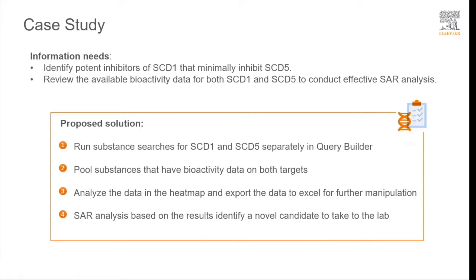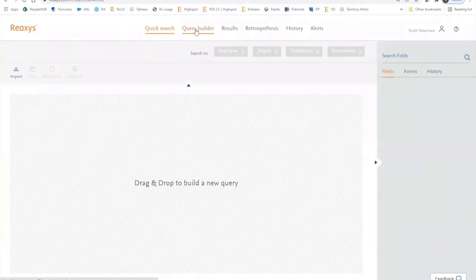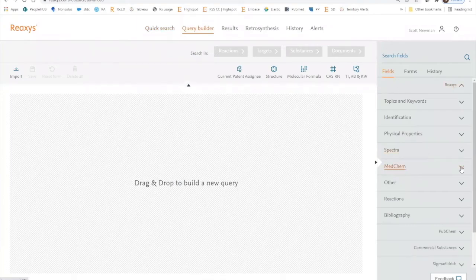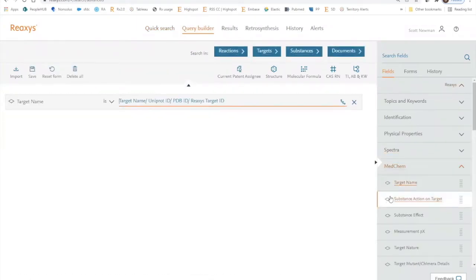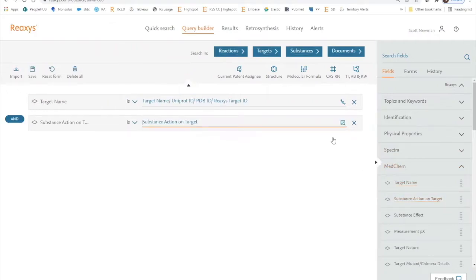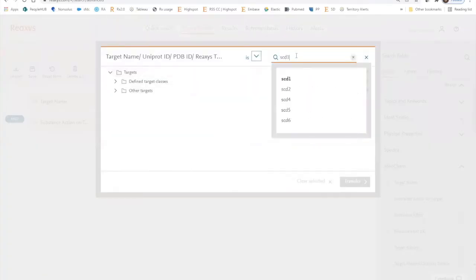Now let's go to Reaxys.com. In Reaxys.com, we'll go to the Query Builder search platform. And on the right-hand side, we'll open up the MedChem window and introduce target name and substance action on target into the workspace. We'll go to the taxonomy tree on the right-hand side of the target name and enter SCD1 as the search term.